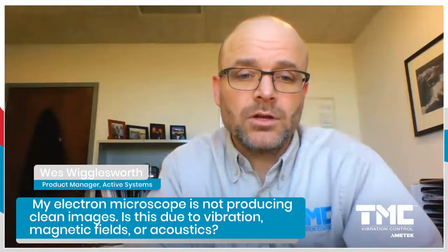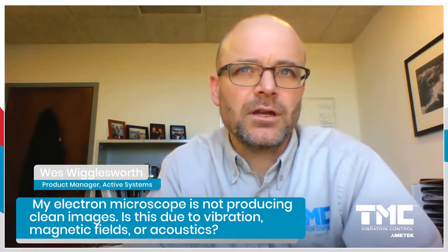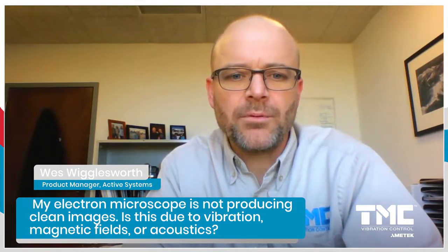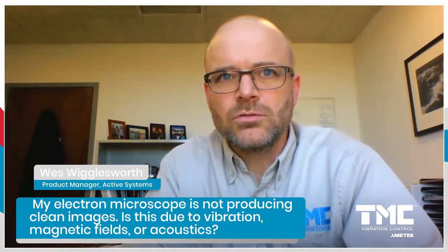Well, it really could be any one of a number of things. Vibration, floor vibration, magnetic fields, and acoustics are certainly three of the most common sources of that problem. Well, really, the best way is to have a field survey done.